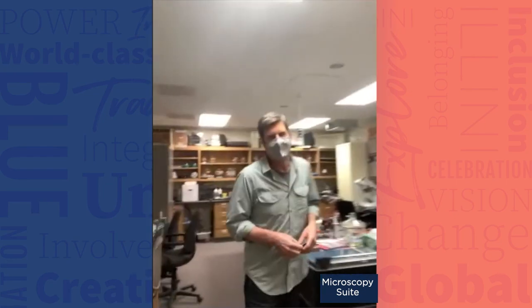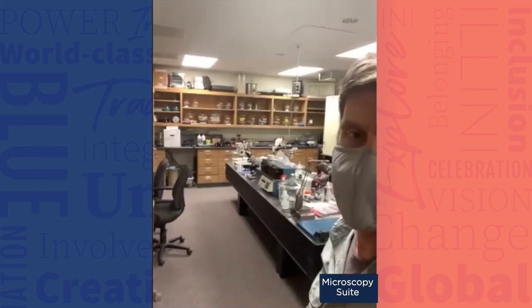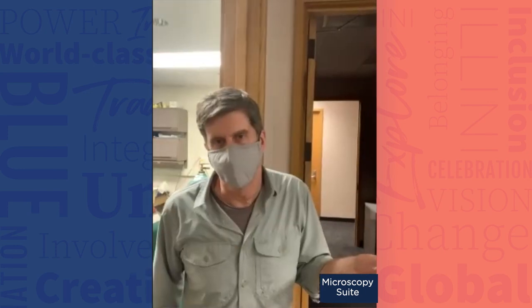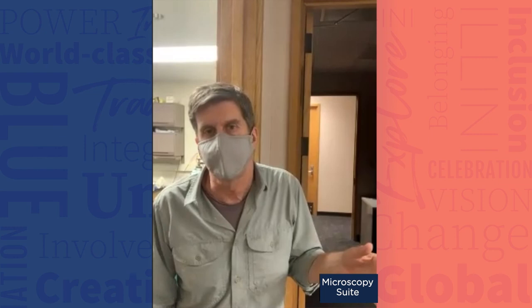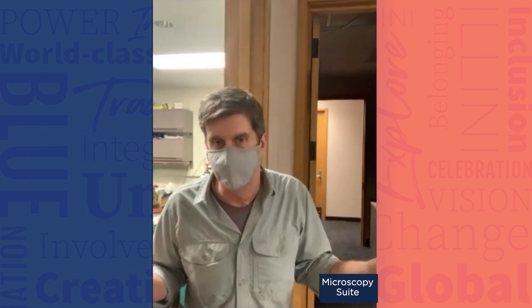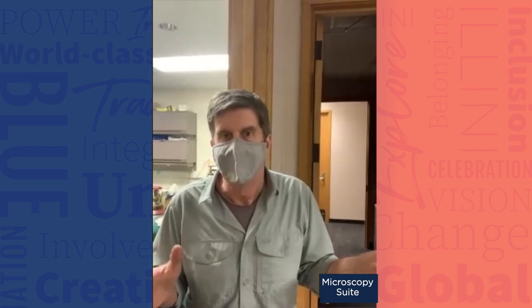This is just another space where we have critical point dryers — an automated critical point dryer and a regular critical point dryer — two ultramicrotomes, a fiber/micropipette puller, a carbon evaporator for making things conductive, and a small tensile stage someone donated. That's really most of it. Right where we are now is the basement of Beckman; down the hall you have SPECT/PET CT for looking at live animals — that's the Molecular Imaging Laboratory, they do some really beautiful work. Further along we have two MRI setups for human subjects, and across the hall there's also sound-related imaging — ultrasound and things like that.